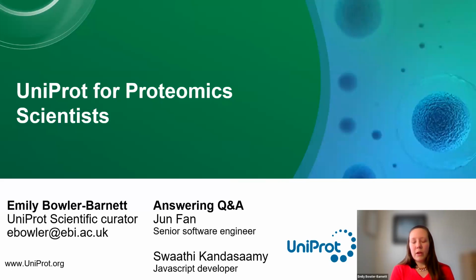I can obviously give you an introduction to UniProt and some tools that you might find useful when you look at large-scale protein data. But we have many training tools online, as Anna said, and she's going to be sending you a few links for those. And I'm also going to be highlighting a few more useful webinars for you at the end of this session.